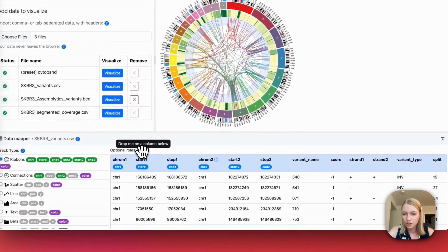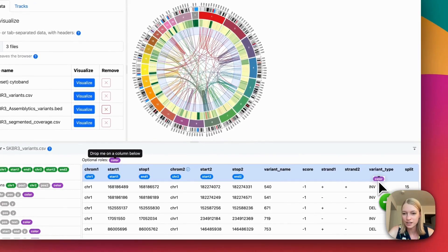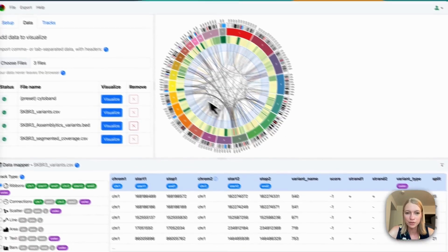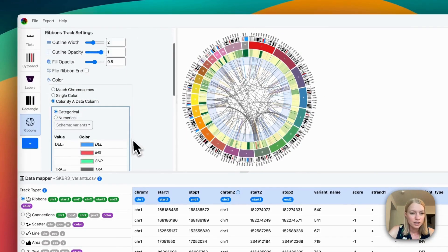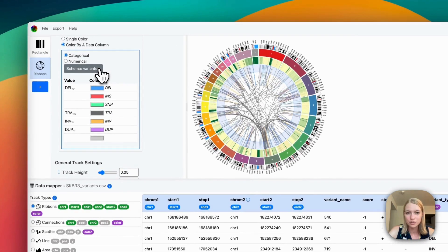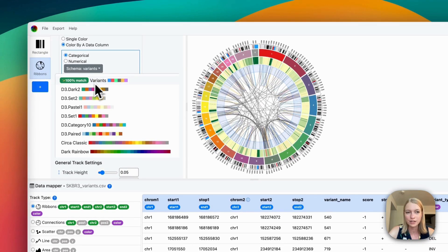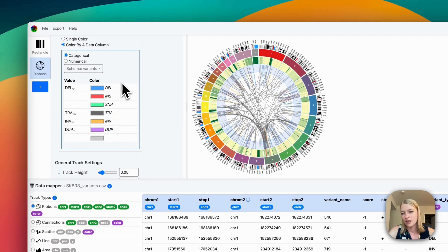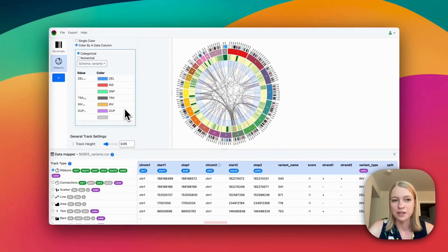We're going to move the color tag over to the variant type, and this is a categorical variable. So it's going to automatically choose the variance color scheme here, because there's a good match for deletions, translocations, inversions, and duplications. And so it's going to choose colors automatically.